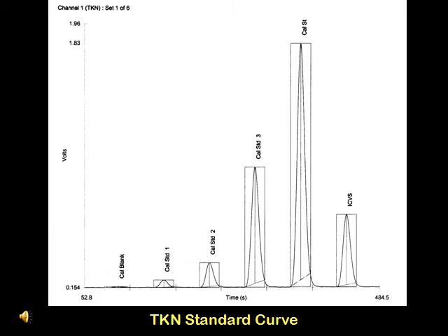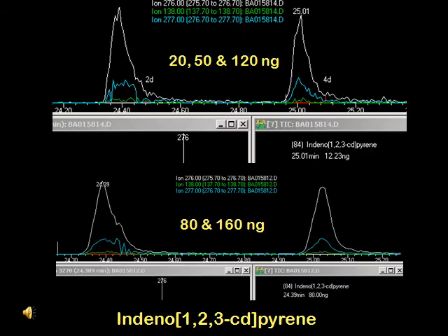In this case, the peak width window should have been set wider to accommodate all of the standard's peak widths, using the baseline as the basis for the peak height. The second type of inconsistent standard responses measures totally unrelated data and can be likened to measuring apples and oranges. This can be shown from an EPA method 8270 analysis.